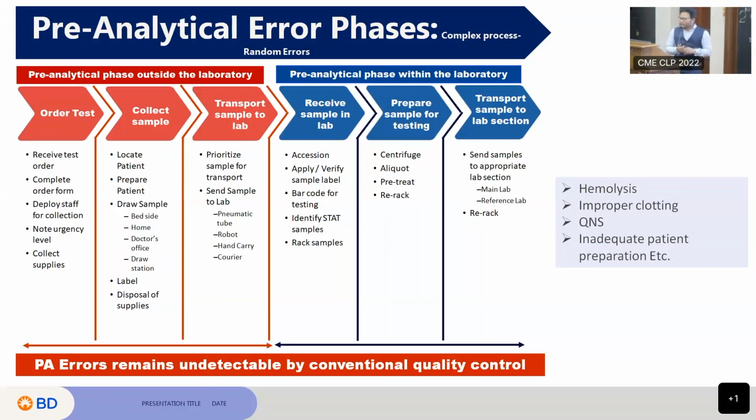Okay. So these are the pre-analytical steps, when inside the laboratory, we need to keep checking all those things: how you are receiving the sample, how much time you are giving for the incubation, and then preparing the sample for the testing. But what is the centrifuge speed? We always see that people get a mix-up with the RPM and the RCF. Right. So maybe it's written that 3,500 RPM you have to centrifuge for 10 minutes. Right? That's a general protocol. But if you see your laboratory centrifuge, might be the setting is in RCF or G, and you are putting in 3,500 RCF.